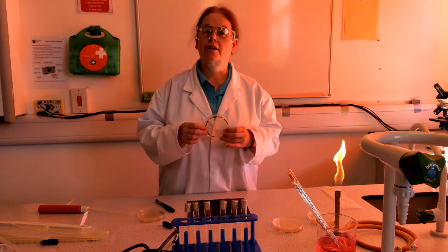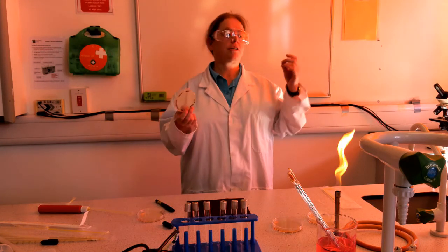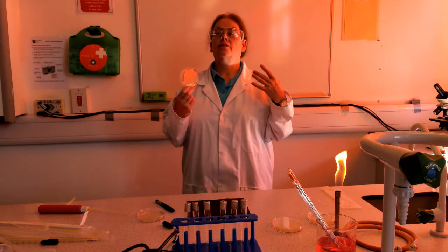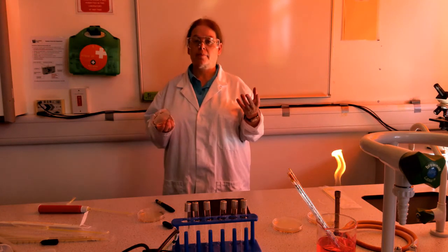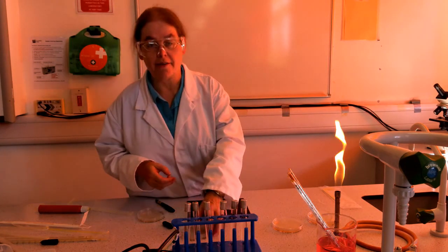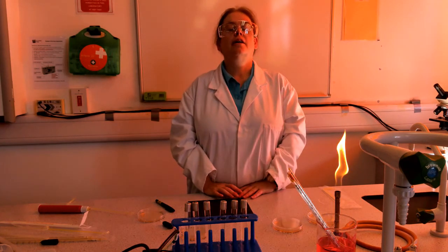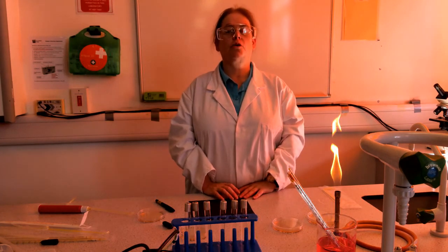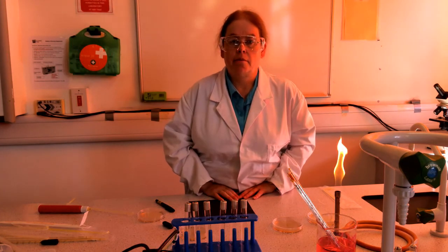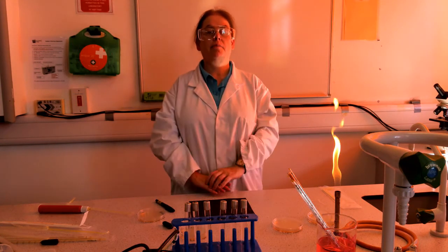And had you been in college, I would have got you all to do this for 4 different types of growth media and 2 different bacteria. But I'm not going to do all of that now. I think you get the idea. I'll leave it to you to make a prediction, and I'll ask you in a minute when you've all finished watching this video what you predict I would have seen. Which of the 4 growth media would have grown most bacteria and why?